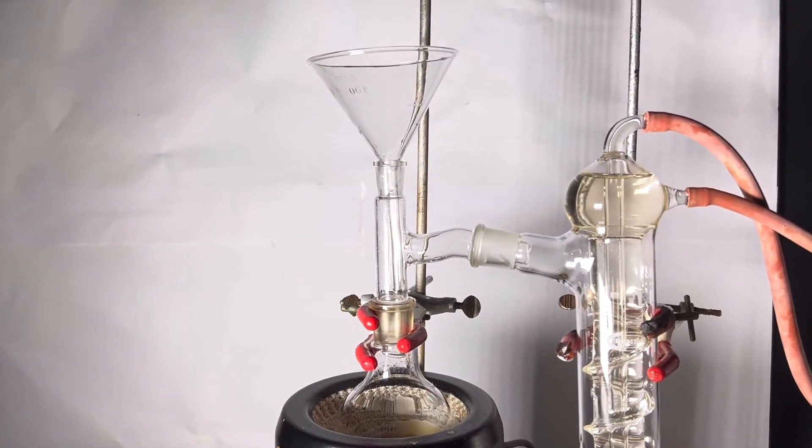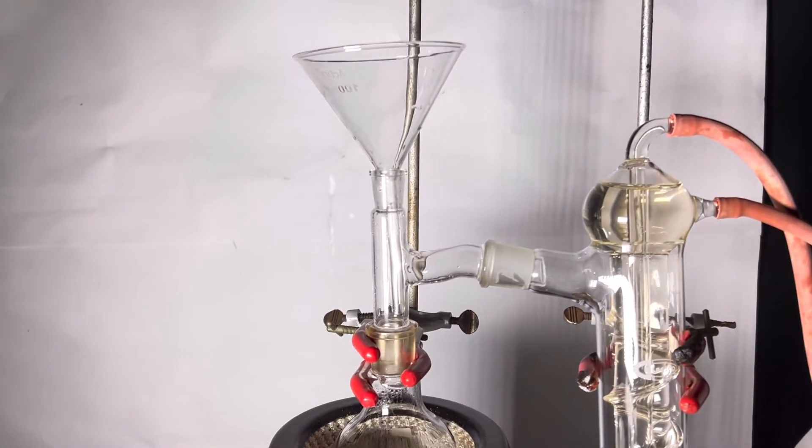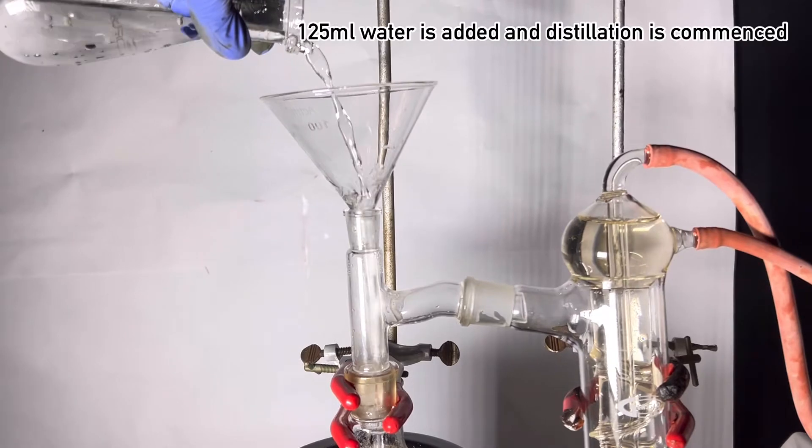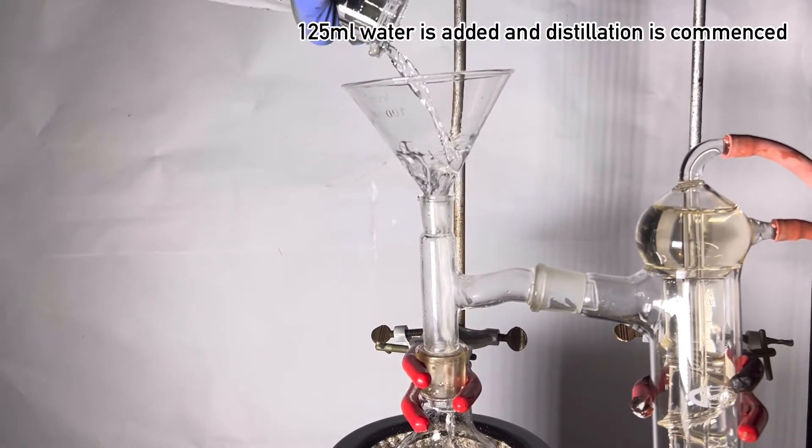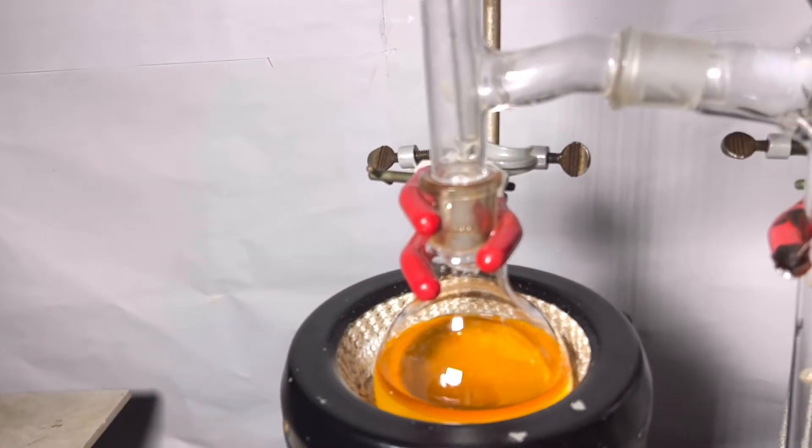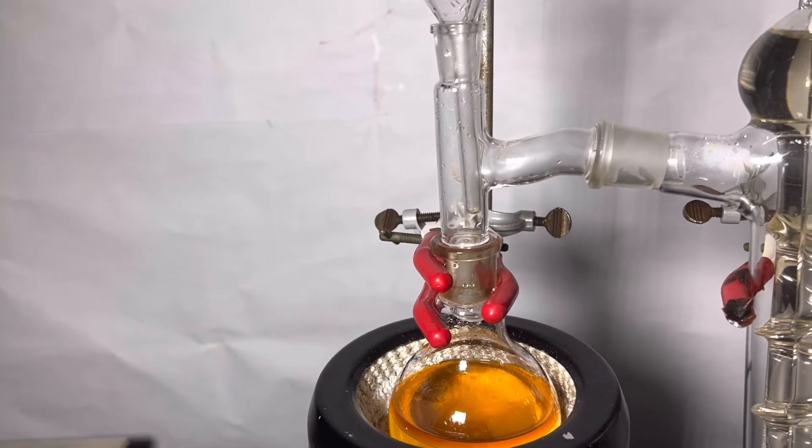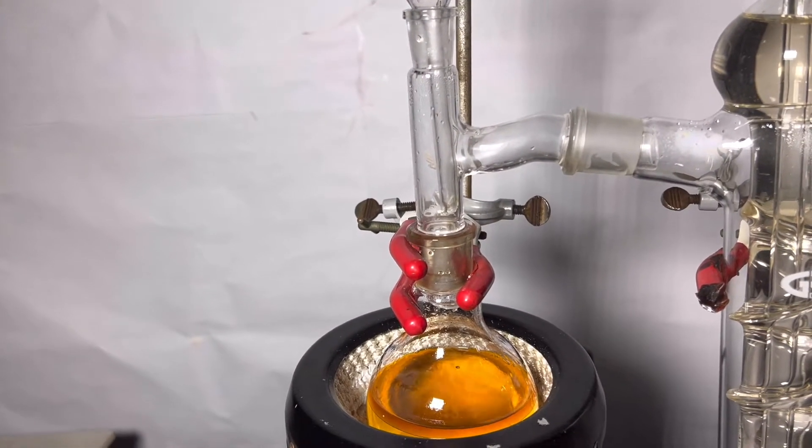Then the flask was set for distillation in a heating mantle. Around 125 ml of distilled water was added. We can clearly notice a dark red upper layer and that is the crude valeronitrile.